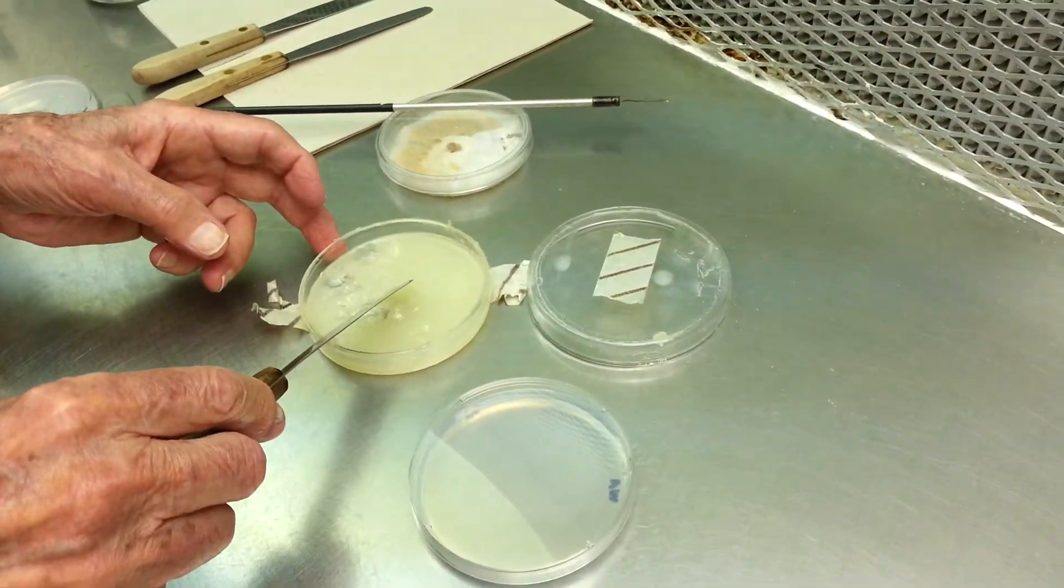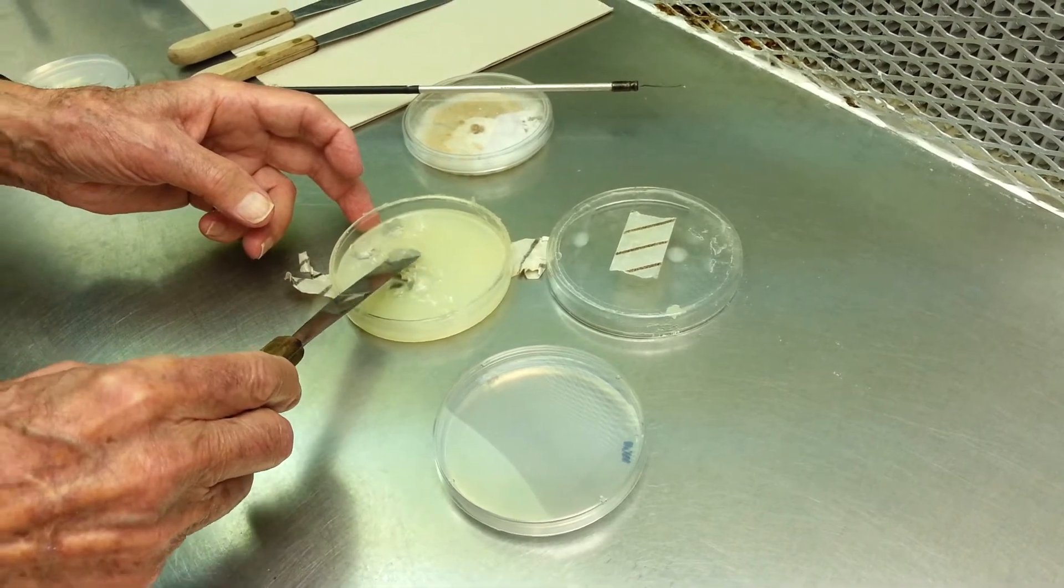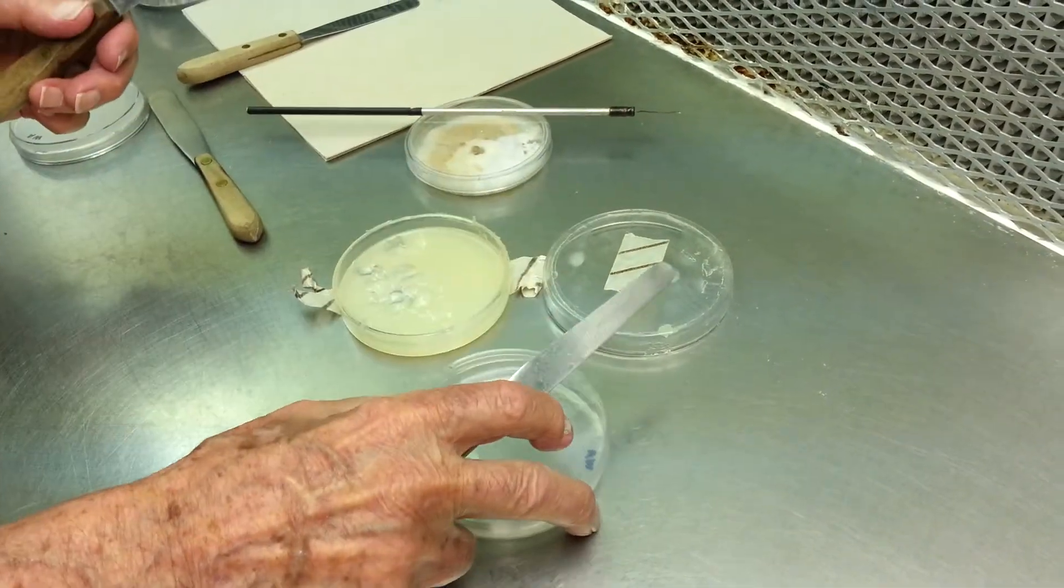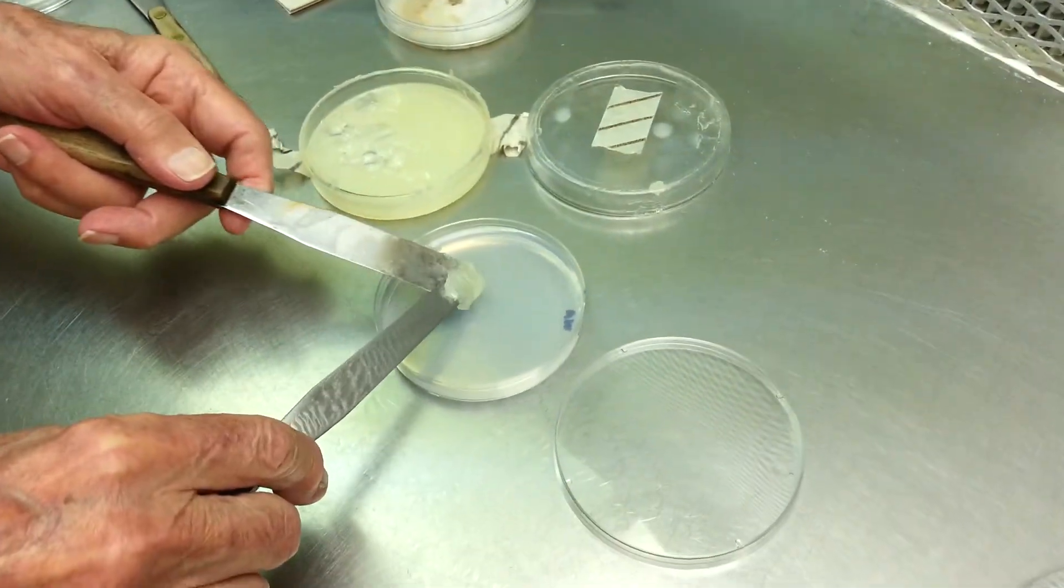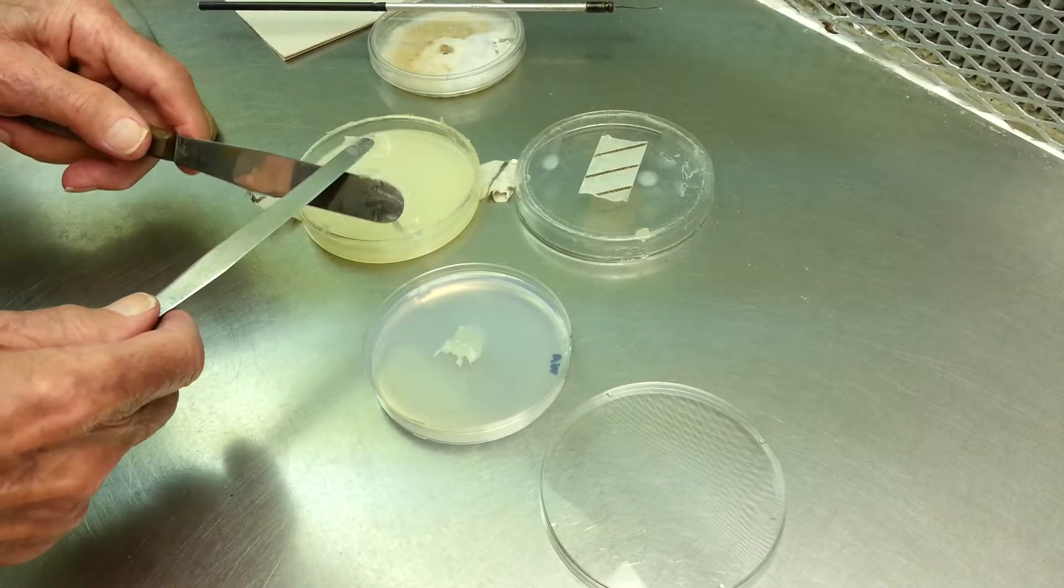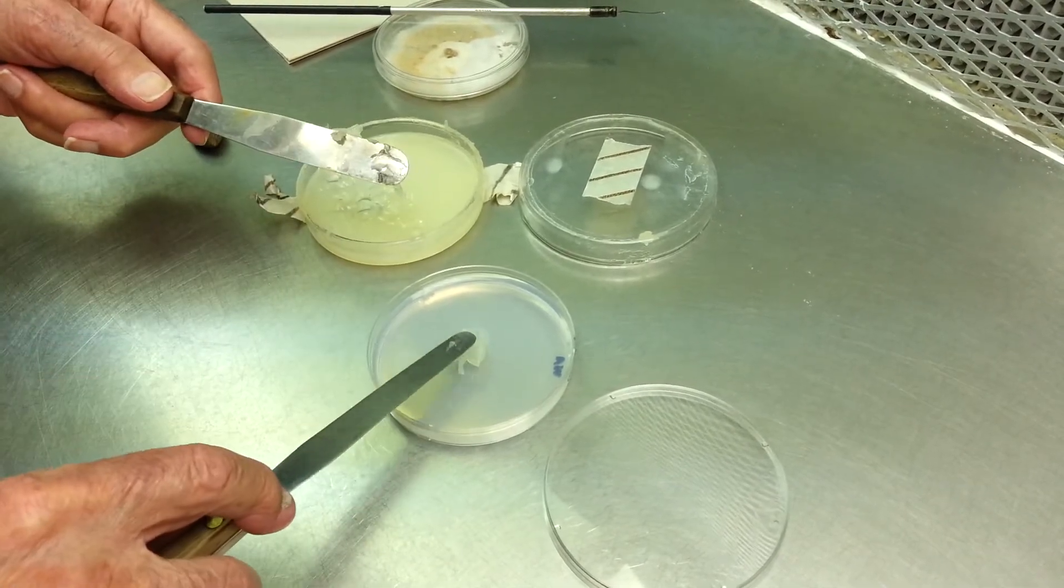We take a small amount of sterilized Vaseline, and put it in the middle of the plate in this fashion, flatten it out.